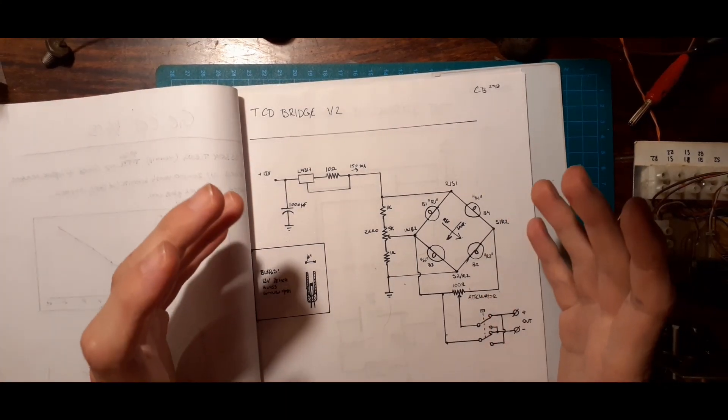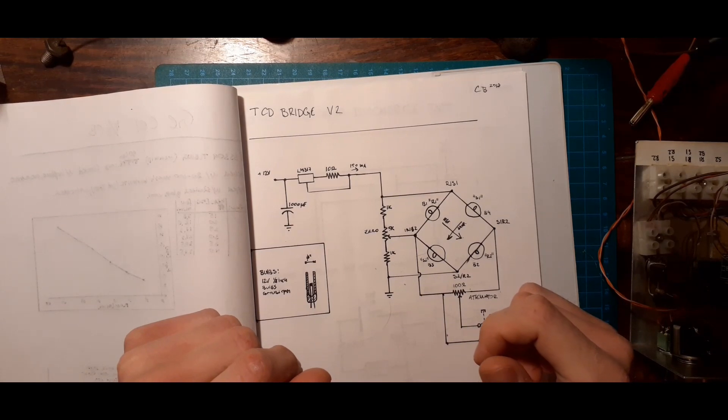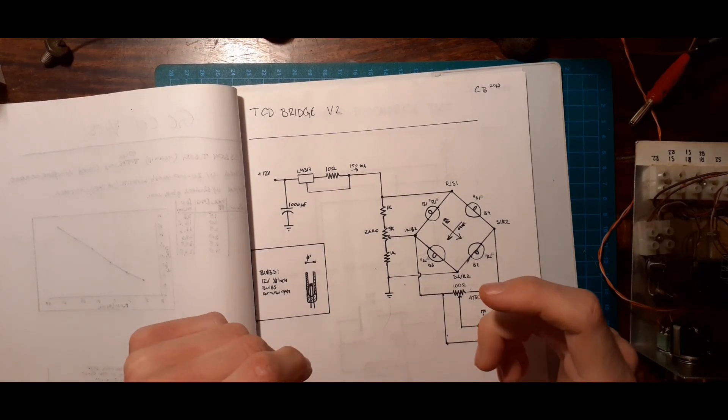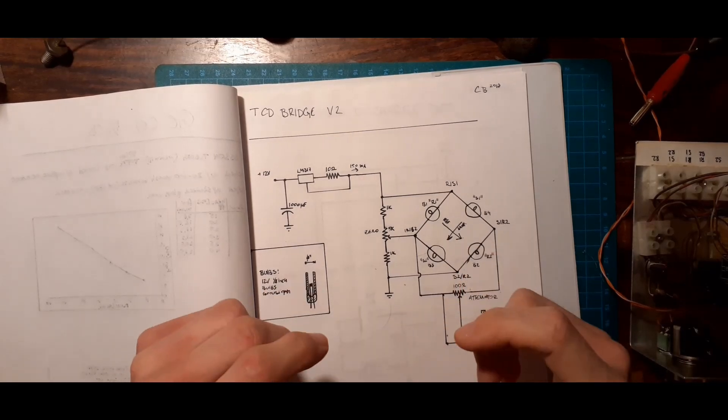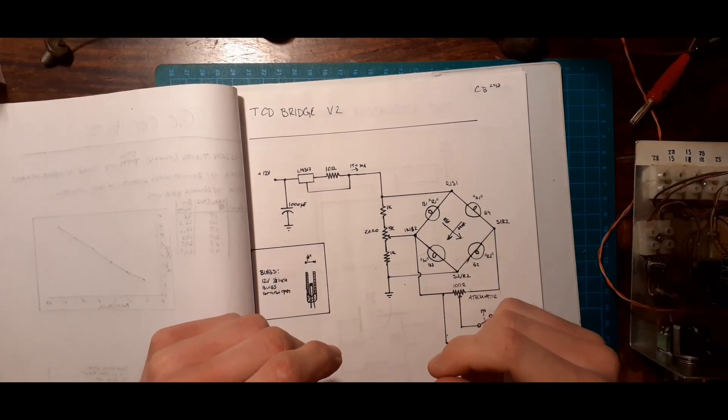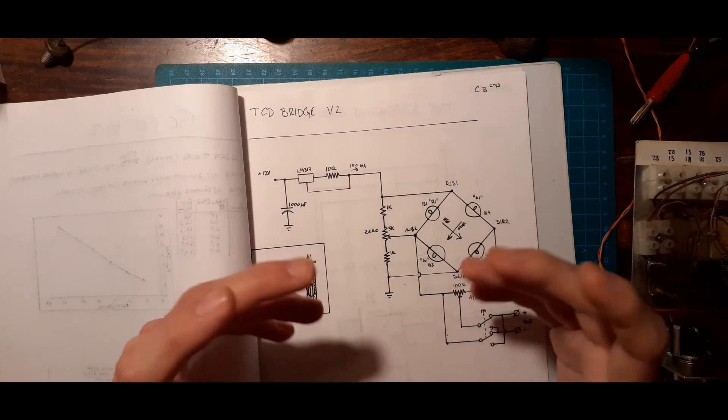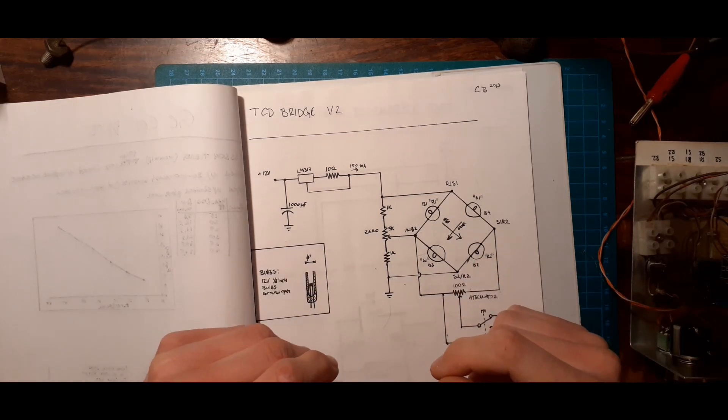Hey guys! So, not much has happened with my gas chromatograph for the past year or so, or half a year at least. I've been preoccupied with other projects. Recently a few people have asked about details of how I built the thermal conductivity detector, and I realized that I didn't really spend much time on that at all in the previous video, so I thought it might be worth a little follow-up video.